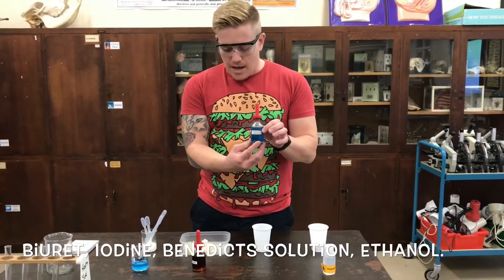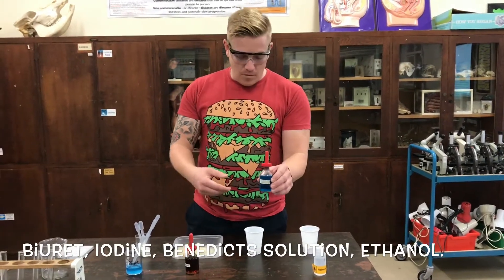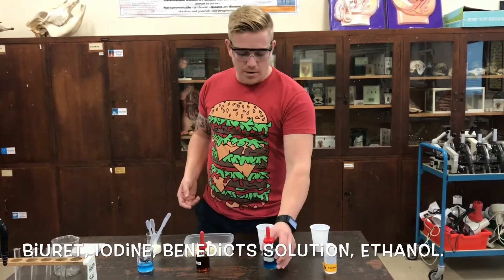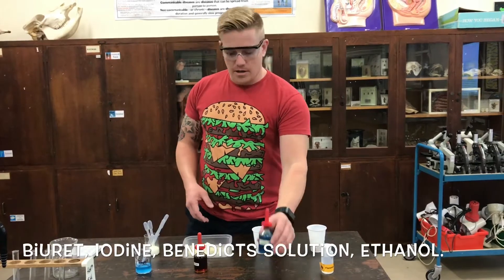We've got the Benedict's solution, and with Benedict's we'll mix that with hot water. We'll put that in the food and then put it in hot water, bring the temperature up, and that will change to a nice orange colour if there is any glucose present.